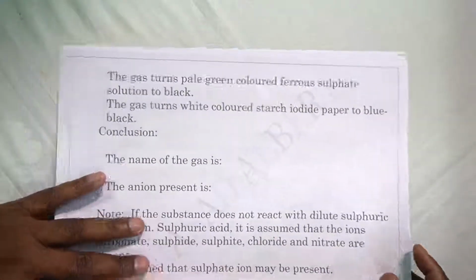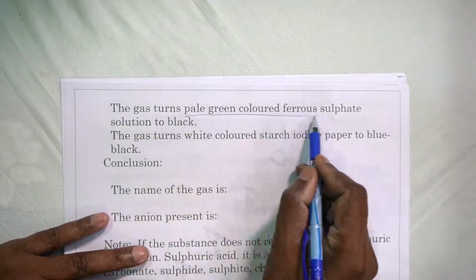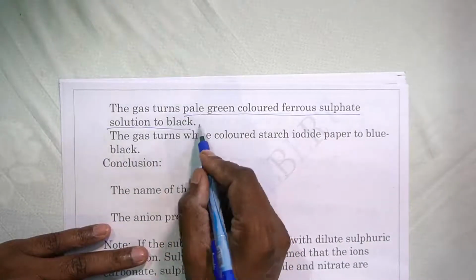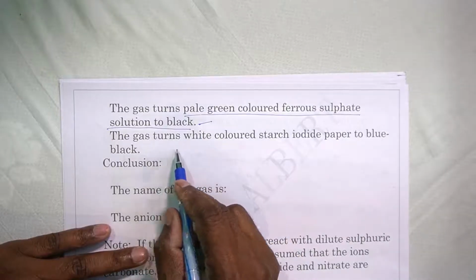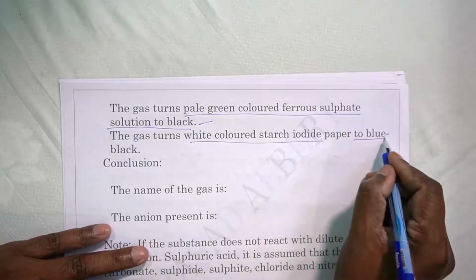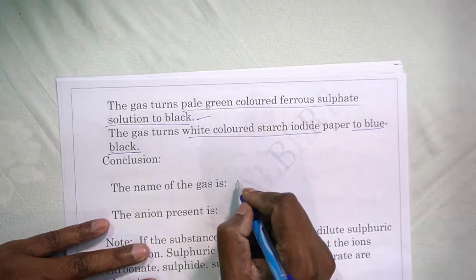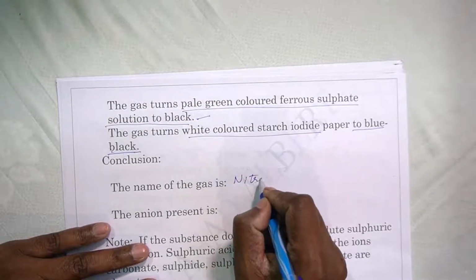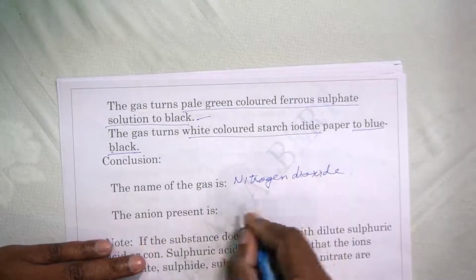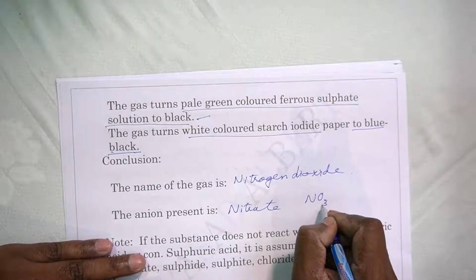Now this gas can also be tested with other reagents. If you take a ferrous sulfate solution, which is pale green, and pass the gas through it, it will turn the pale green solution to black. The gas also turns starch iodide paper, which is white colored, to blue black. A bluish black color will be formed. This clearly shows that the gas is nitrogen dioxide. What is the gas? Nitrogen dioxide. So the anion present is nitrate. What is it? Nitrate, NO3 minus.